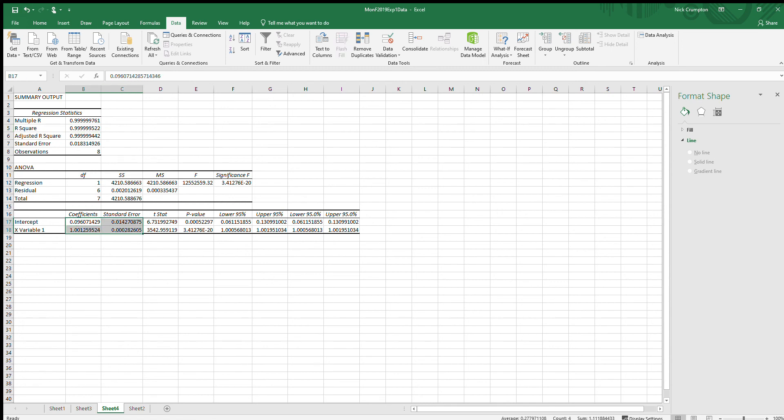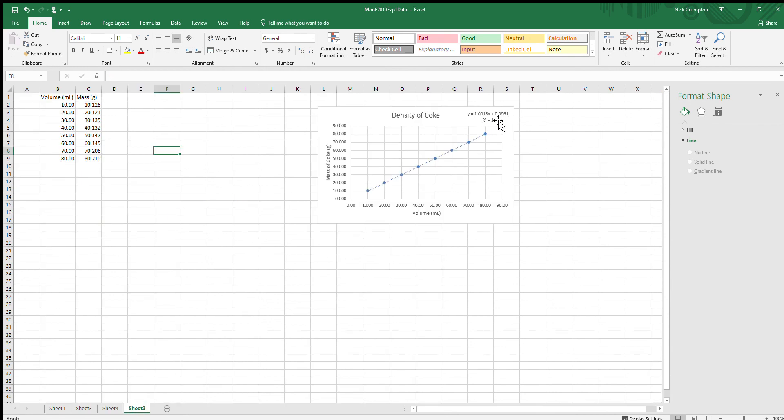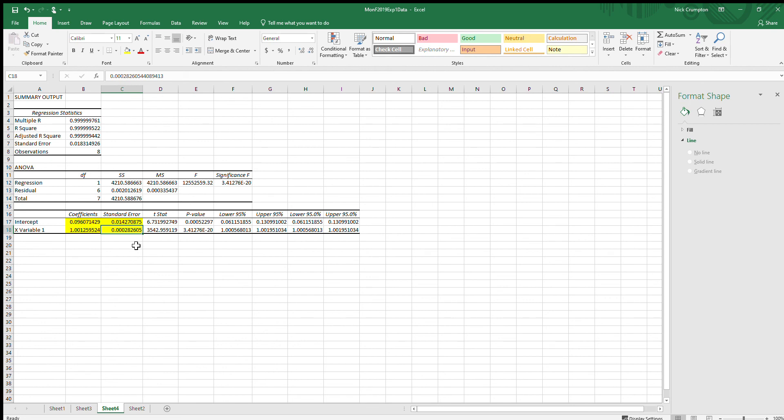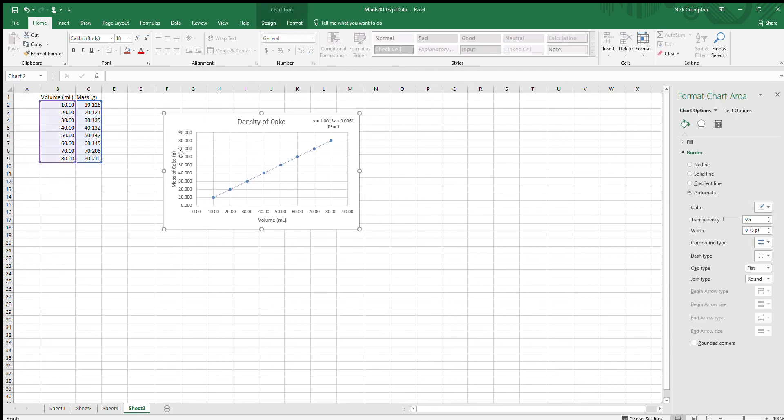Down here is the stuff that you're going to need to snag for your reports. The intercept is the y-intercept, 0.09607. If we go back to my graph, 0.0961, so 0.09607 rounds to 0.0961. The number next to it is the uncertainty in that value, so the intercept is 0.096 plus or minus 0.014. The two numbers below it are the slope of your graph and the uncertainty in the slope. Your slope is 1.0012 plus or minus 0.00028.